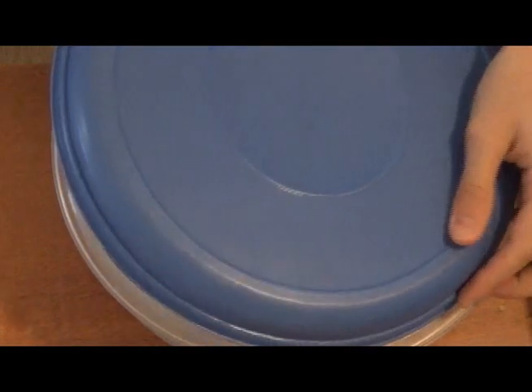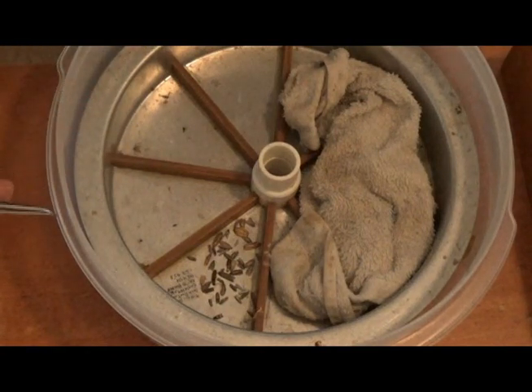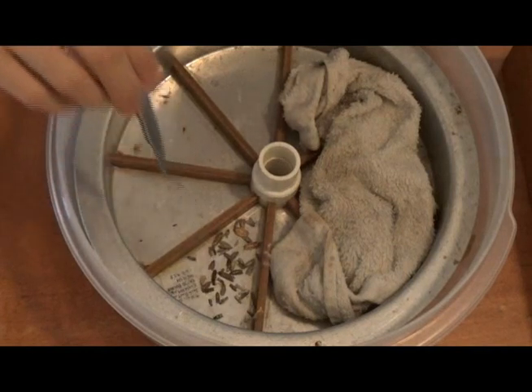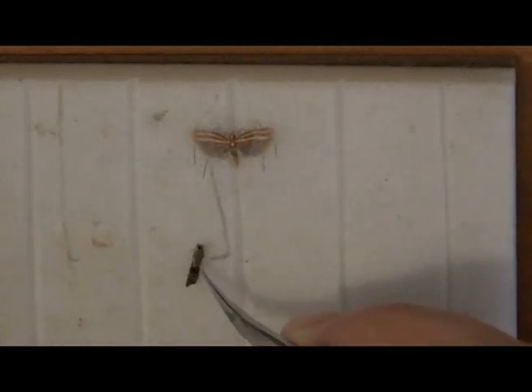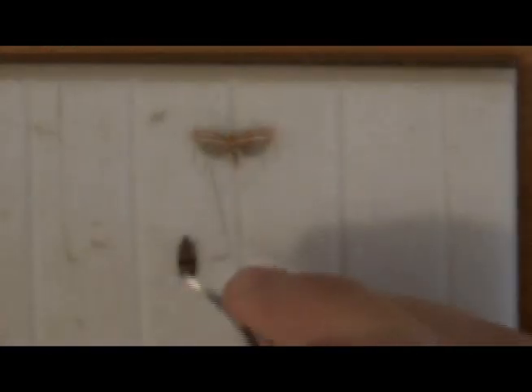The moths are now ready to spread. Using my fine forceps, I select a moth to spread and carefully take it out, remembering to close the lid when I'm done. I spread micro moths in a piece of dense foam with thin grooves cut into it. I'll carefully drive a minuten through the center of the thorax.